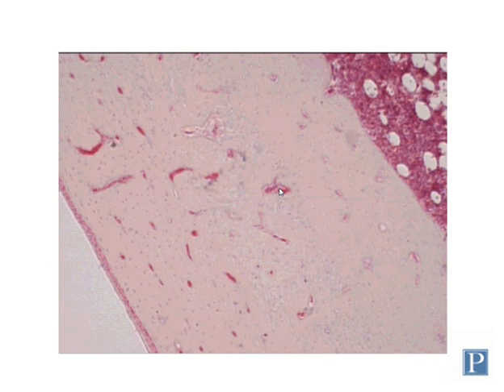The disadvantage of this particular preparation is that it really destroys the inorganic architecture of the bony matrix, and so by removing the calcium salts and sparing the cells with this method, when you section it, you don't actually see a lot of the geometry of the bony matrix. And in order to see that, we use an alternative preparation, which is called a ground bone preparation, which we'll show you here in a little bit.